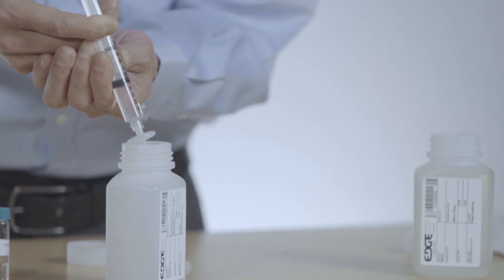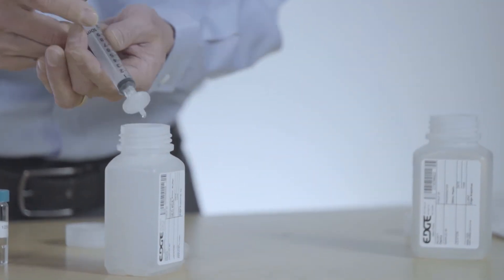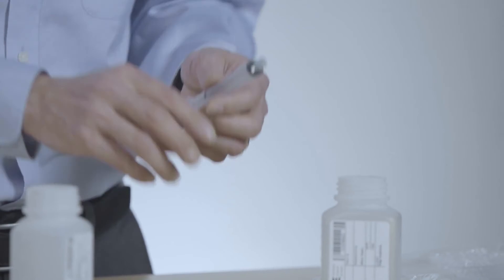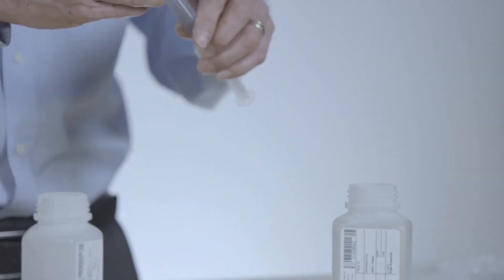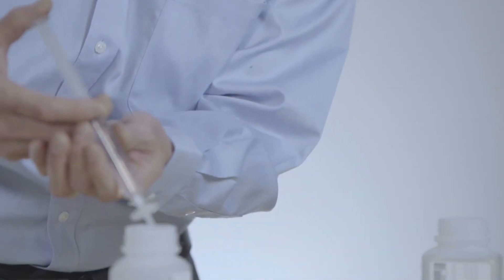We're just going to continue to do that. I have clean water here so it's moving very smoothly. If these filters do plug up, there's a spare one just in case. I just removed that one filter, and I'm going to come back in here and refill my syringe. This is a long slow process — 10 mils at a time. You're going to take at least 10 of these.